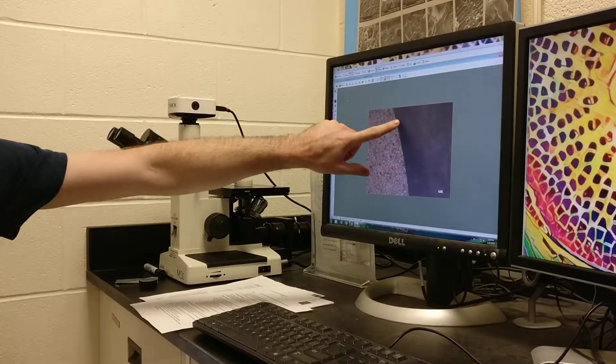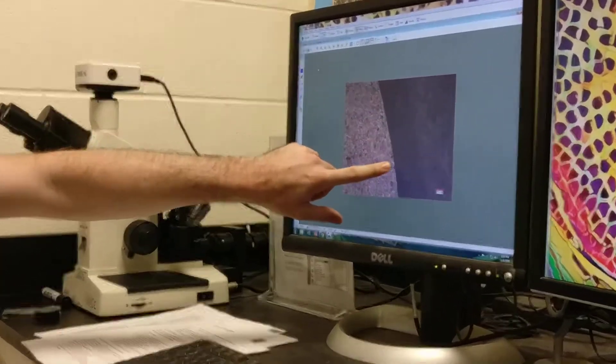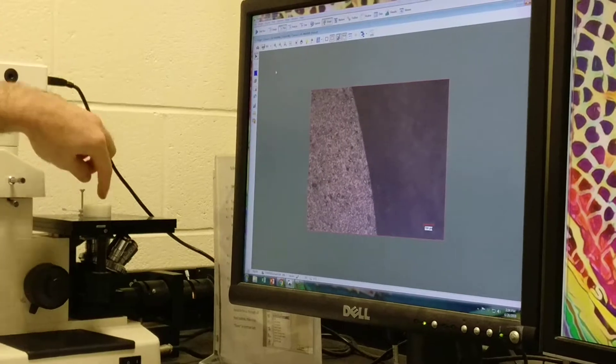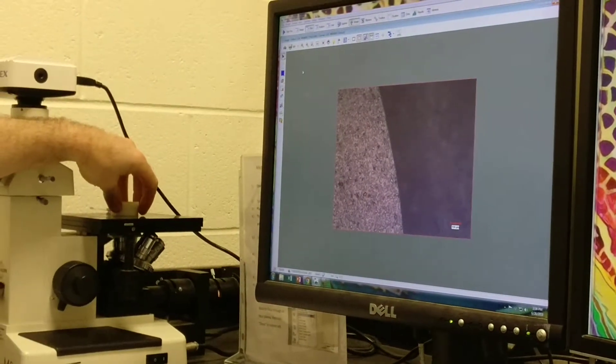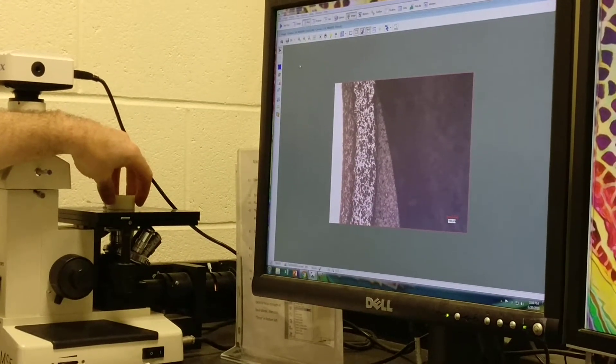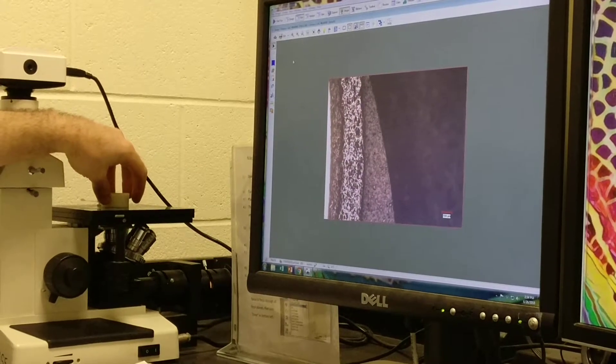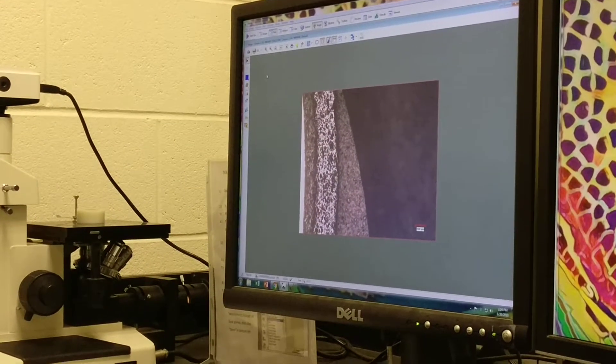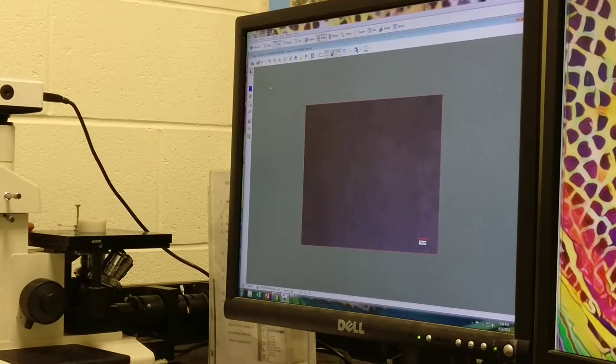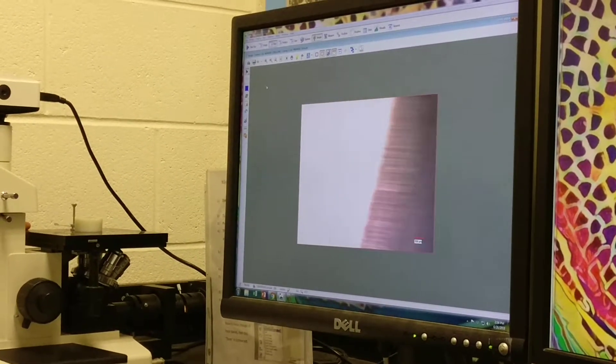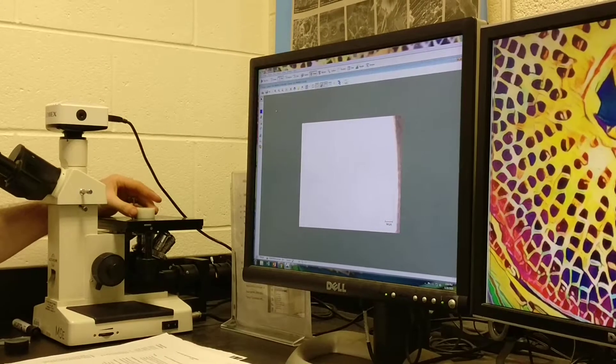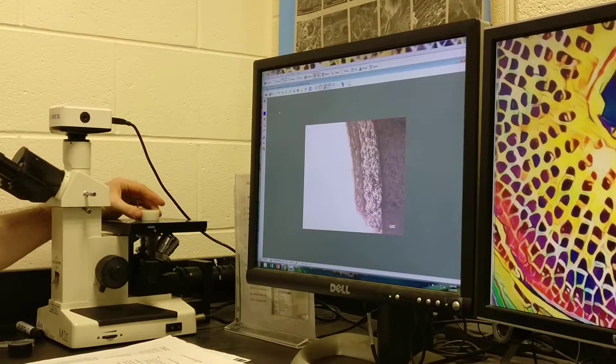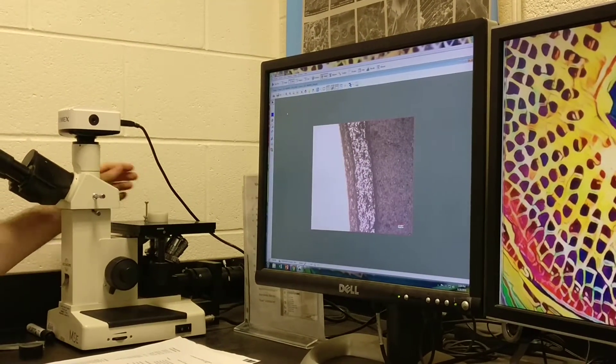We can see the sample here adjusting our fine focus. You may think that this is the edge of your sample, but if I move the sample on the stage, you see how it actually is not the sample. It's actually the edge of our stage, the hole in our stage. If we move that over, now we can actually see the edge of our sample.